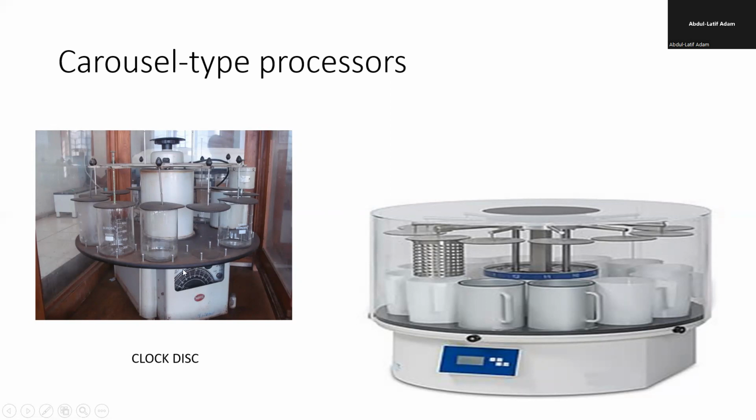If you want to set a delay, you will not make the indentation at the beginning of 24, but you make the indentation for the number of hours you want the tissue to start. If it's in the 70%, you're going to spend 30 minutes or 1 hour, then you make an indentation at the time you want it to start. After 1 hour, you make another indentation so that it will stop there.